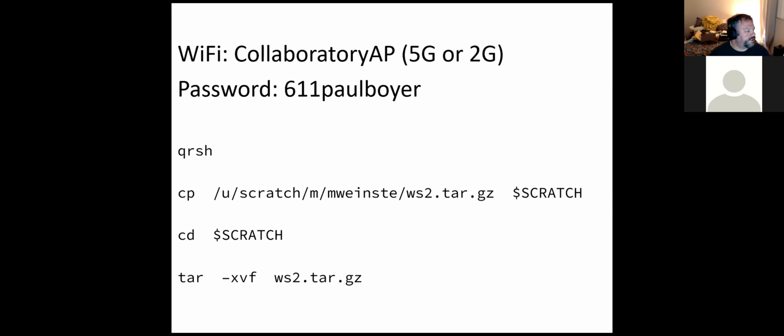All right, so if you're still either running this or waiting for it to finish, just hit the raise hand button so I can see how many people are still waiting. Okay, I see quite a few people still pinging on that one. So okay, I'll give it a few more minutes.